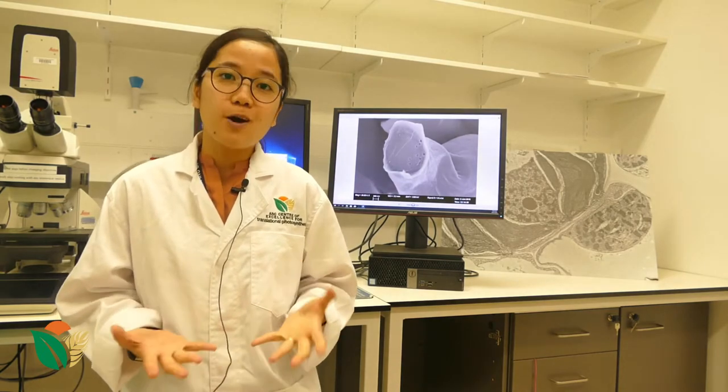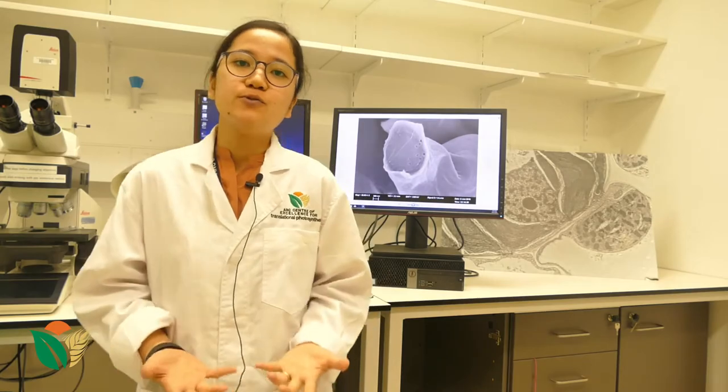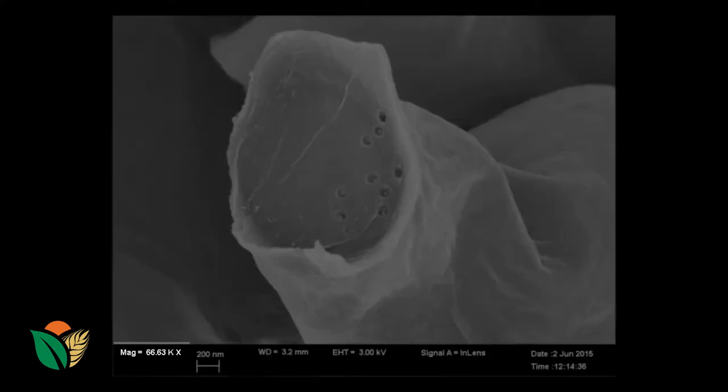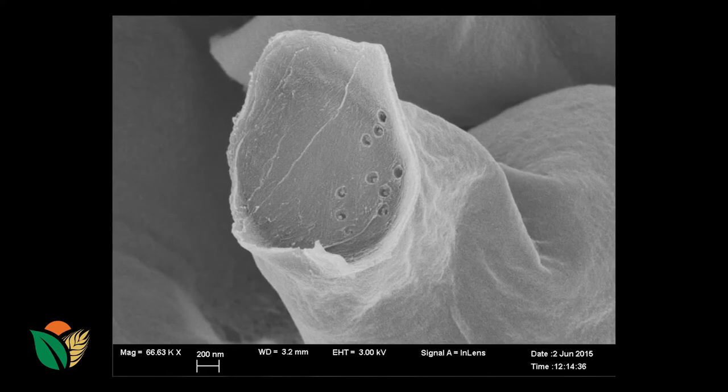To show you an example of what an electron microscope can produce — here is an image of a rice leaf under a scanning electron microscope. Here I am showing you a junction between two cells in a rice leaf, and this junction is where the Plasmodesmata are normally found. In this image, you can see that the magnification is 66,000 times what we can see with the naked eye. That's really important because most of my work involves quantifying these structures, and having this clear, highly resolved image is very important.